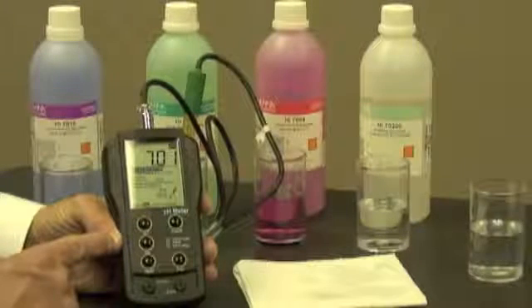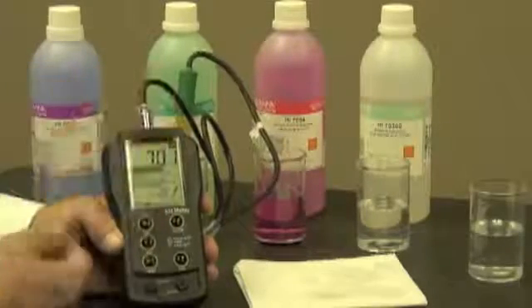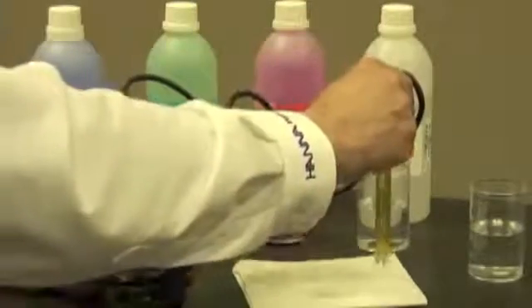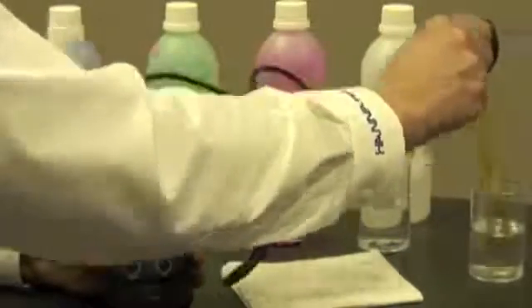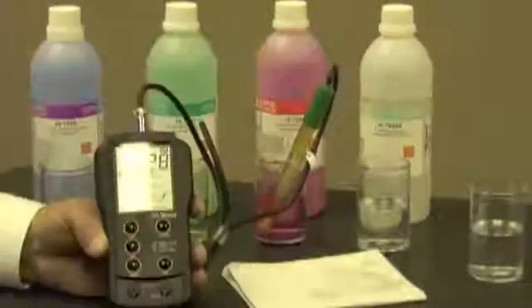Depending on what I'm going to measure — if it's an acid or a base — I'm going to choose either a 4 or a 10 buffer. Since I'm going to measure something that's acidic, I still want to rinse my electrode off, dry it, and put it into a 4 buffer.